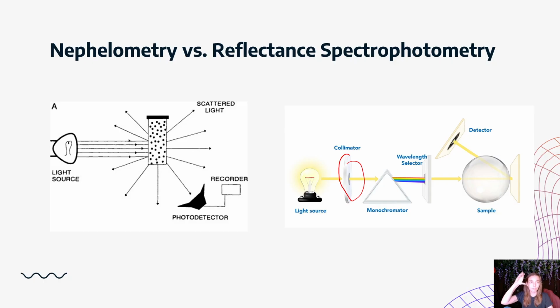It makes the light physically smaller. Then it goes through your monochromator and splits into a bunch of different wavelengths of light. We pick the one wavelength that we want, and it stays very physically small the whole way through. It bounces off the backboard, and it still stays small as it keeps going through the system.